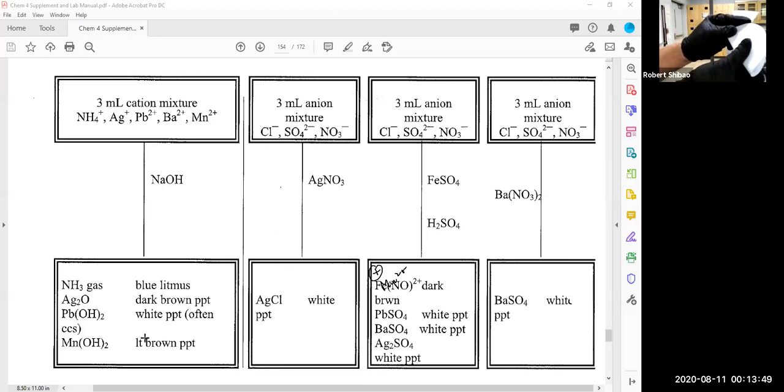When you fold the filter paper, you fold it in half once, like this. And then you fold it into a quarter section like this. Now I was taught to tear off an edge, but I don't bother doing it. I can never see the edge, and it didn't really improve filtration. Okay, but the filter paper doesn't stick, so we got to make it adhere to the funnel. So what you're going to do is you're going to separate it, but you're going to end up with 3 sheets of filter paper on one side and 1 sheet on the other side.